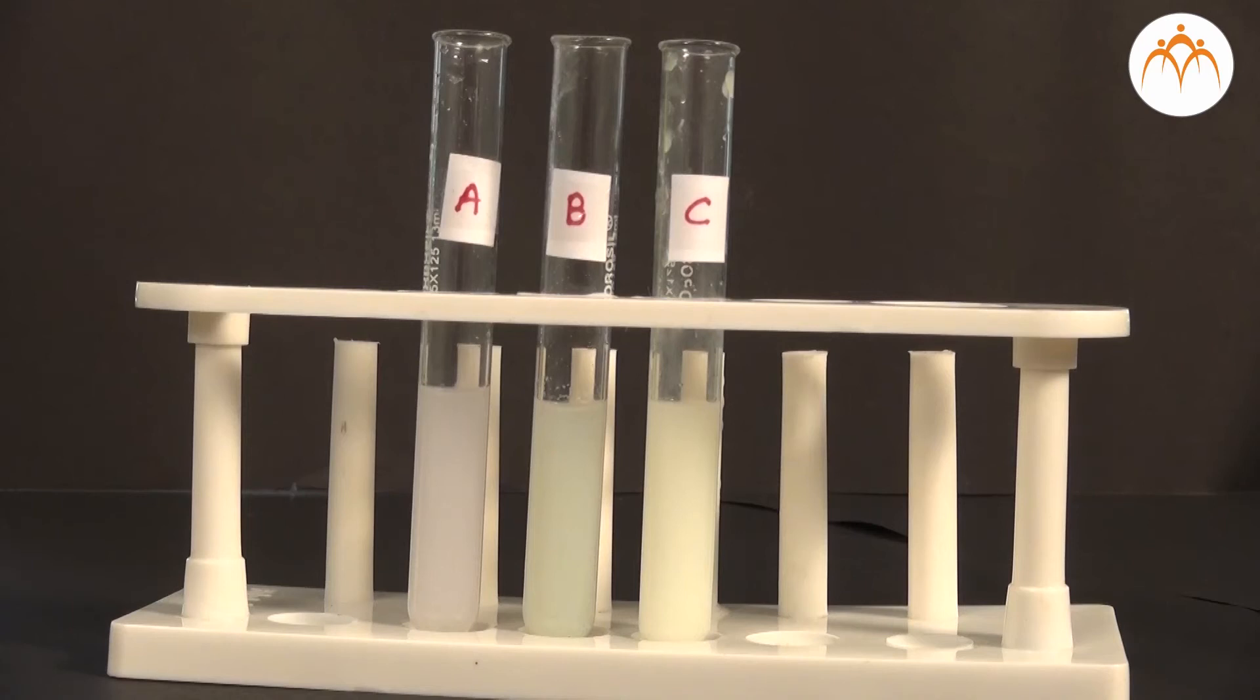The color indicates which ion exists in a particular solution. White color indicates that there must be chloride. Light yellow color indicates bromide and dark yellow color indicates iodide in the solution.